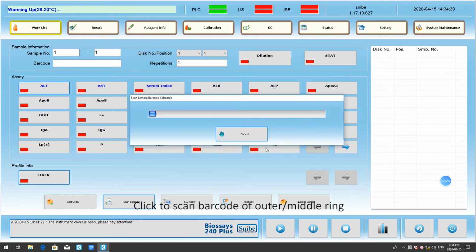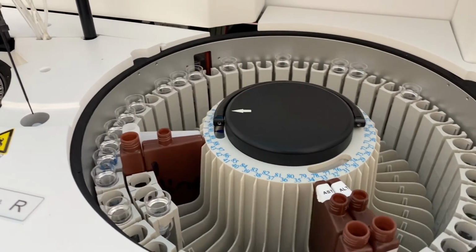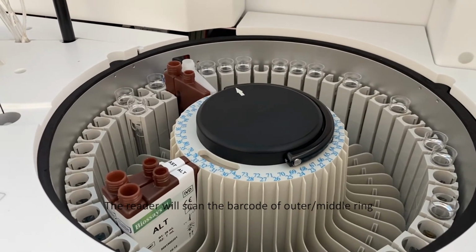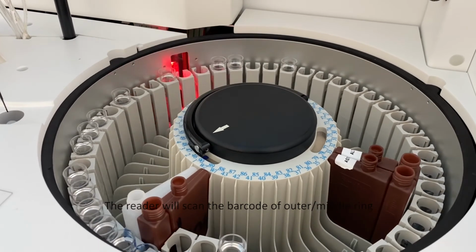Click to scan barcode of outer or middle ring. The reader will scan the barcode of outer or middle ring.